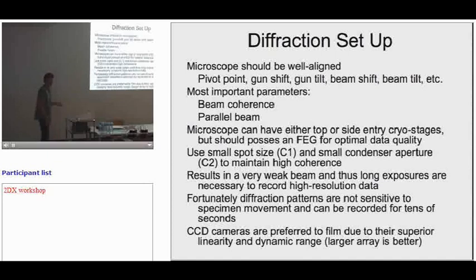It's just your screen looks as if it were black in imaging mode. But the nice thing is diffraction patterns are insensitive to translations. So you can take a very long exposure. You can take a 30-second or even a minute exposure of a crystal, and you don't have to worry about drift or any of the specimen-induced beam movements, or beam-induced specimen movements, sorry. Any of those things that happen that would destroy an image, for diffraction patterns you're still okay.